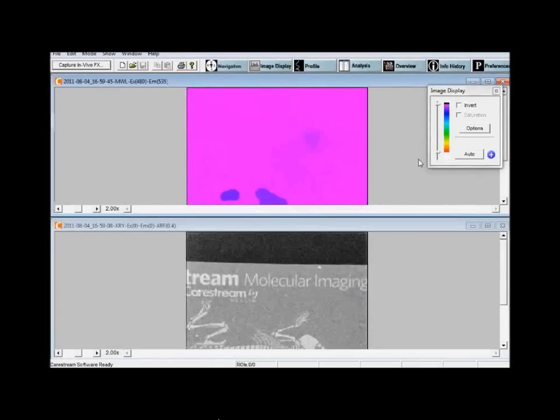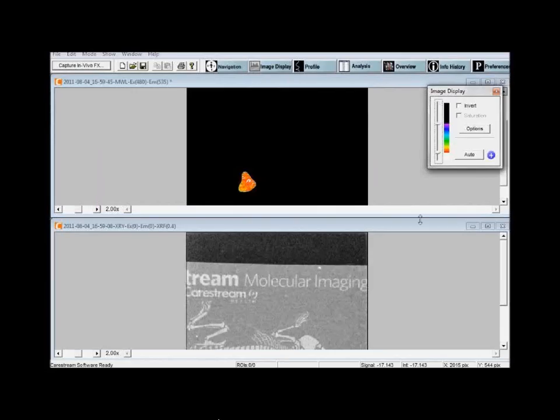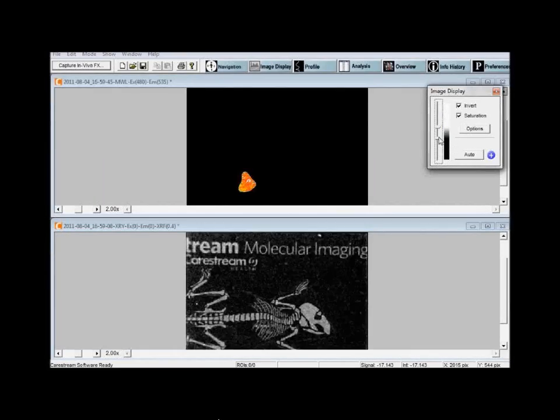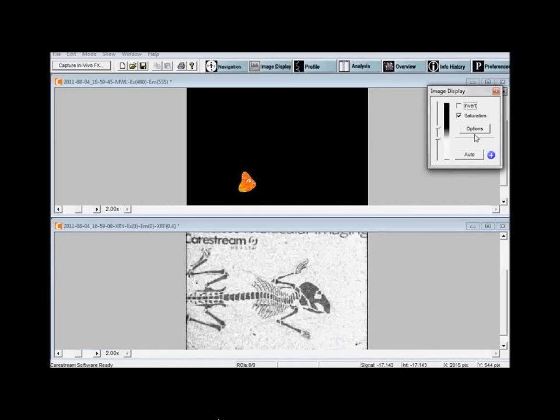And we'll show a simple method finally for displaying multimodal registration using the available image display tool. We'll be stamping the fluorescent image on the X-ray image. We want to contrast the fluorescent image such that the background is black. Contrast the X-ray image to your preference. And then next, maximize the image display tool. You can see here that the transparency checkbox has been selected.